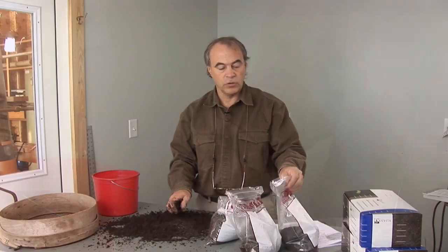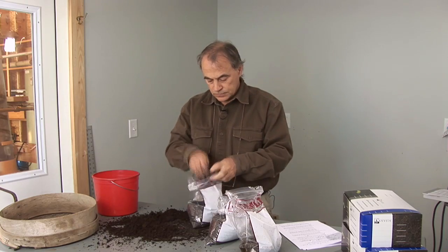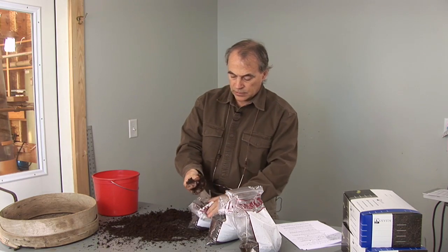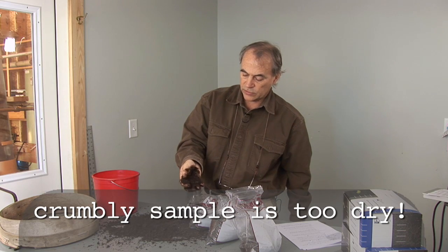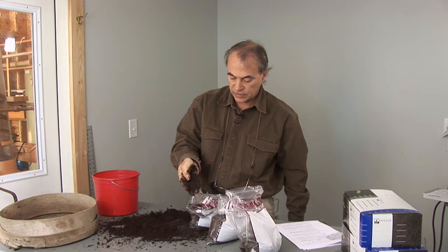Now let's look at a sample that's too dry. This compost — I can't even squeeze it into a clump and it just falls through my fingers. It's definitely too dry for a Solvita test.